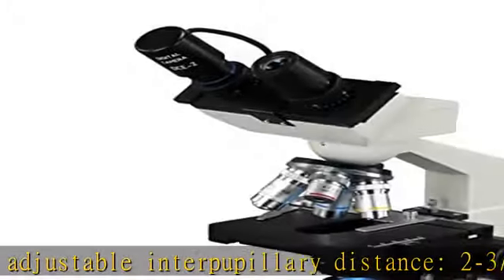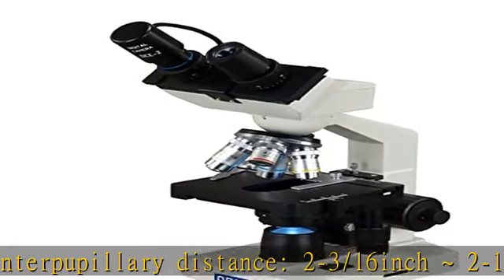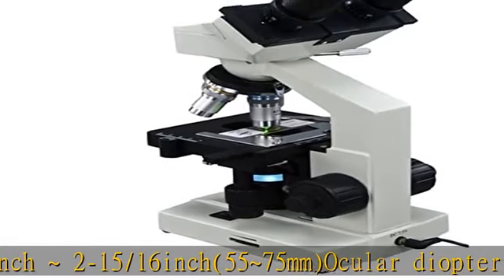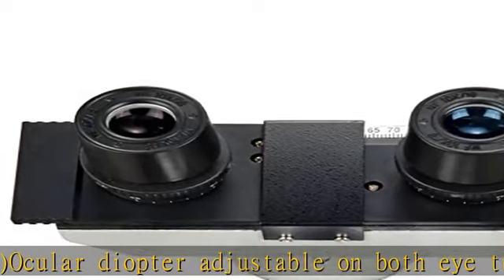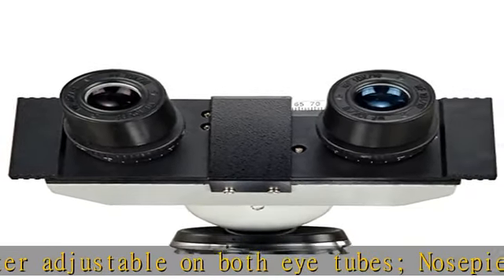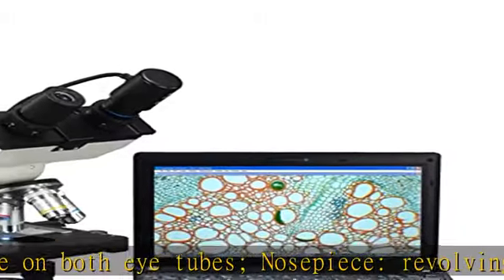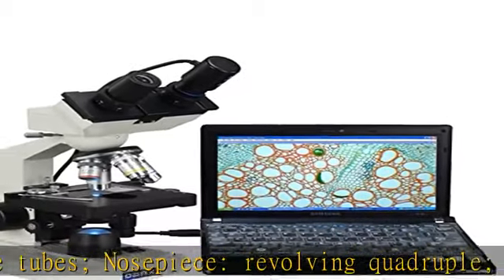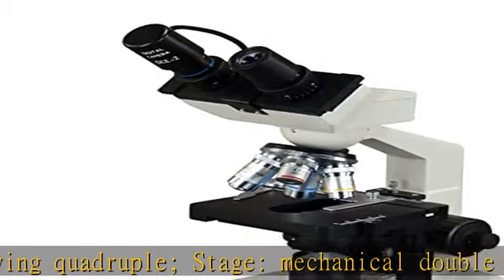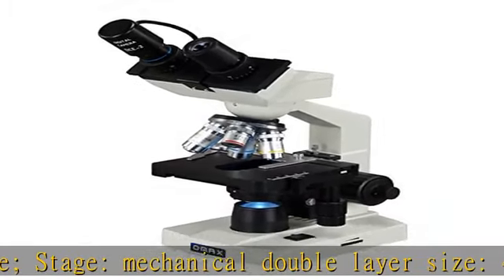Nosepiece: revolving quadruple. Stage: mechanical double layer, size 115mm x 125mm. Stage XY stroke travel range: 70mm x 30mm.